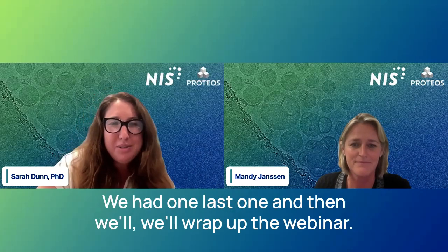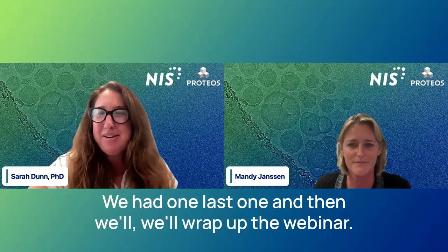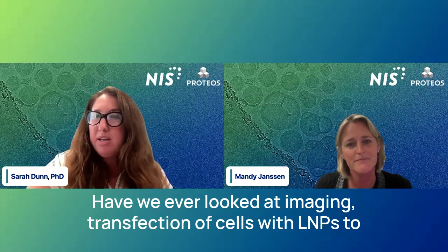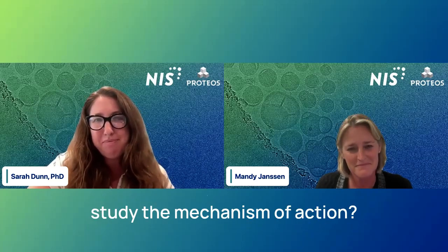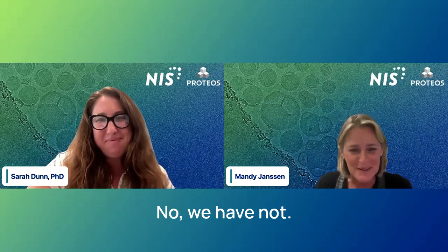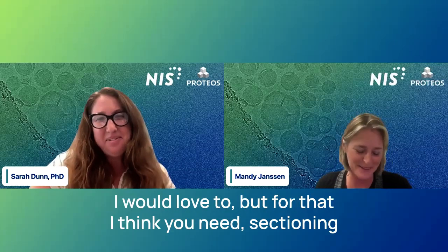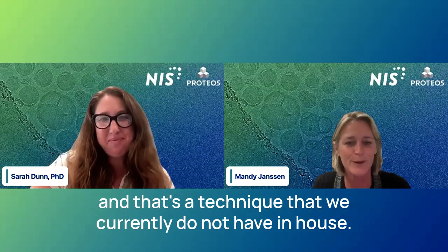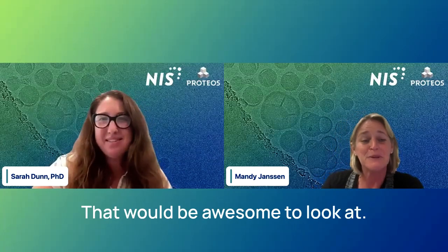All right, we had one last one, and then we'll wrap up the webinar. Have we ever looked at imaging transfection of cells with LNPs to study the mechanism of action? No, we have not, but that's a great question. I would love to, but for that, I think you need sectioning, and that's a technique that we currently do not have in-house. Right. That would be awesome to look at.